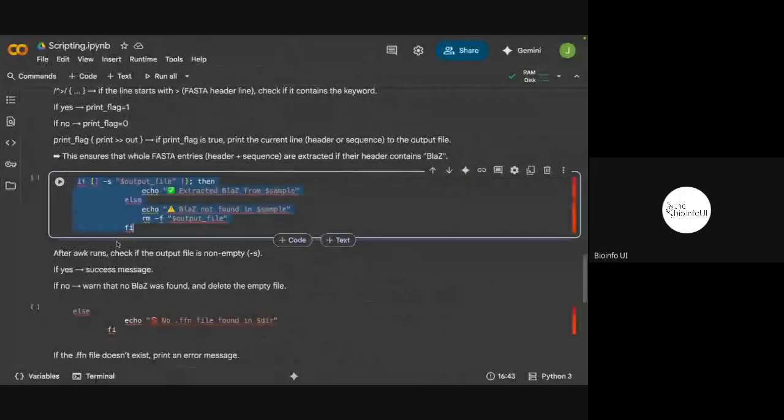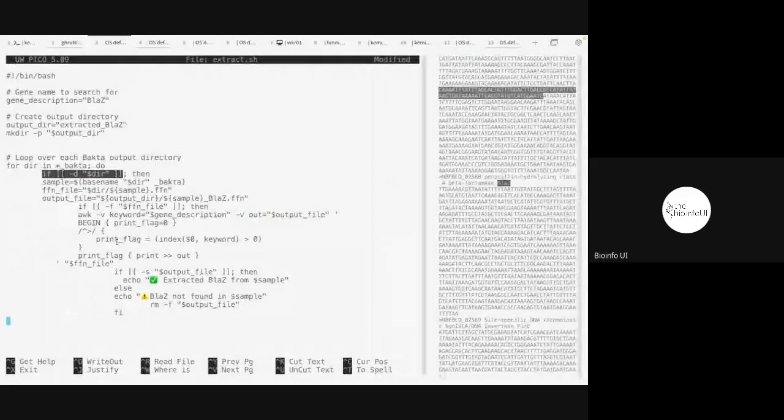Please permit me to interrupt again. I also get where Abib is coming from, but maybe we can have two separate scripts. We stop before using the awk, extract those files first, then run the awk command, direct it into another folder, and continue with the second part of the script.